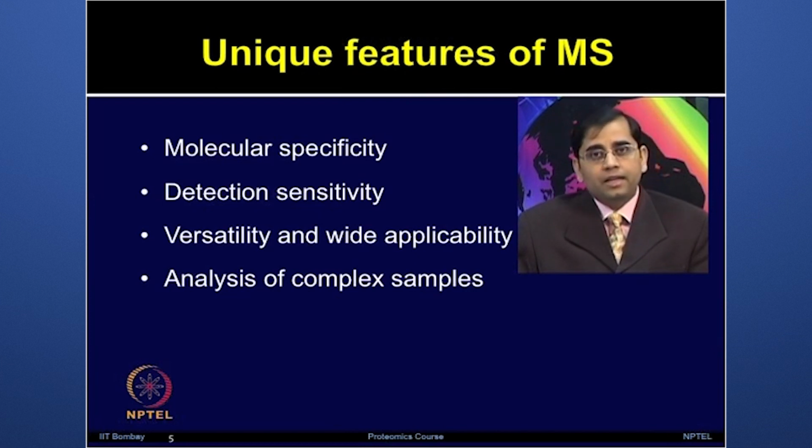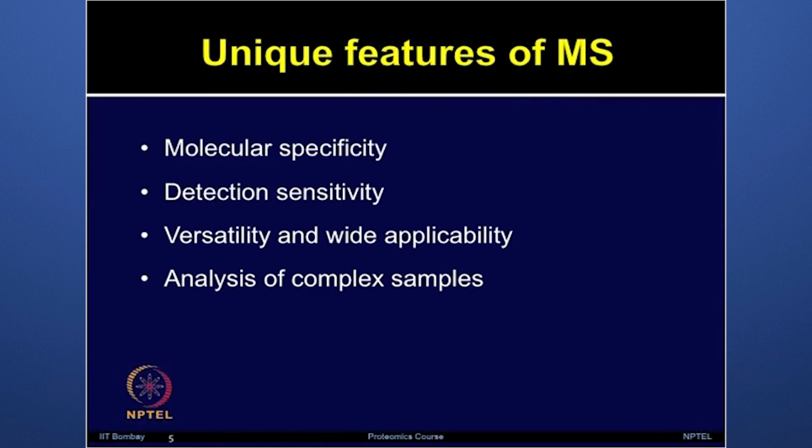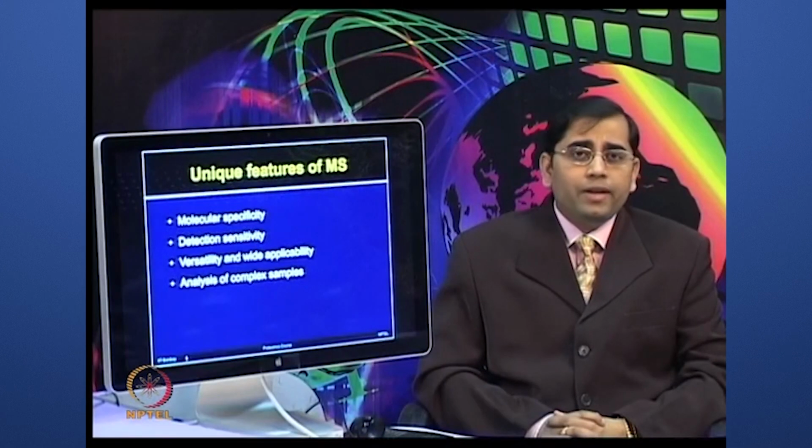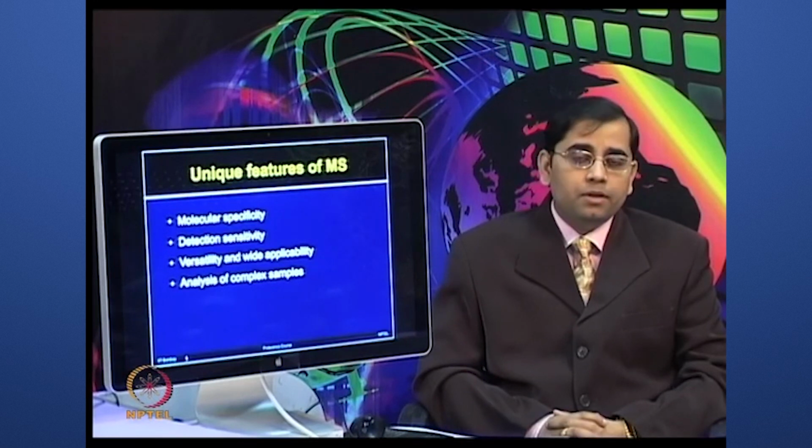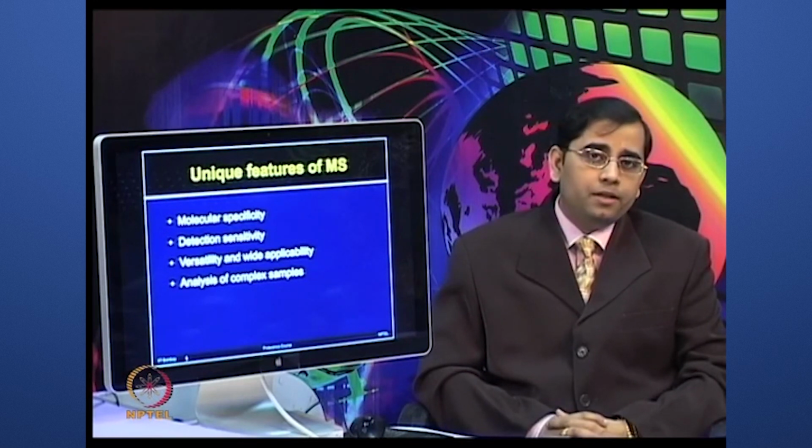It provides a versatile platform to determine the structure of compounds, and it is applicable to all the elements, all type of samples, whether it is volatile, non-volatile, polar, non-polar, as well as solid, liquid or gases. So, analysis of complex samples such as proteome is very much possible by using MS.